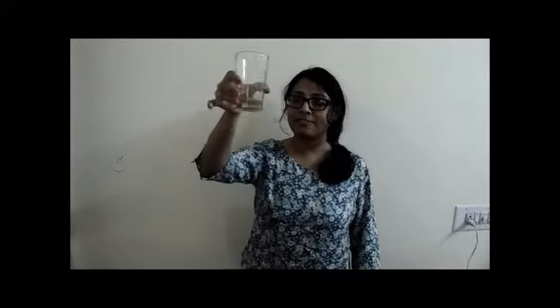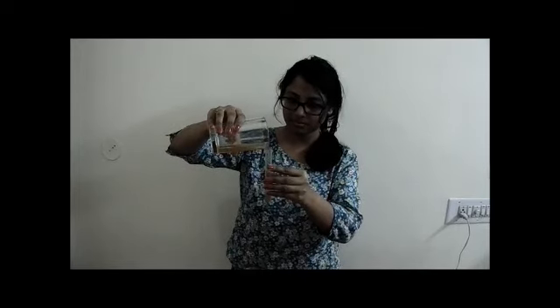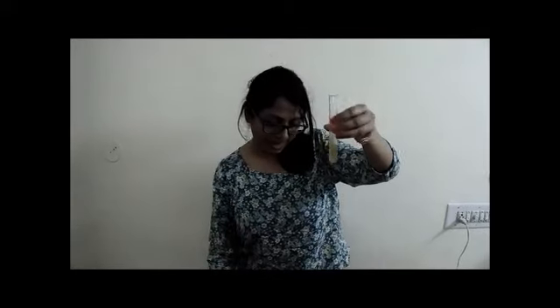Let's take this filter paper and make a cone. Put it over the funnel and now pour this mixture into it. This is the filtered solution. We will transfer it into a test tube. This should be enough.